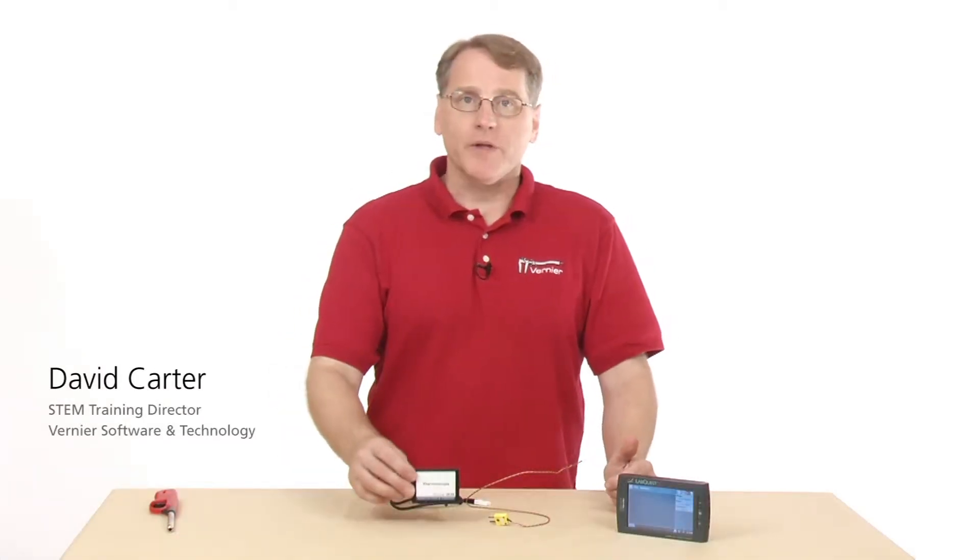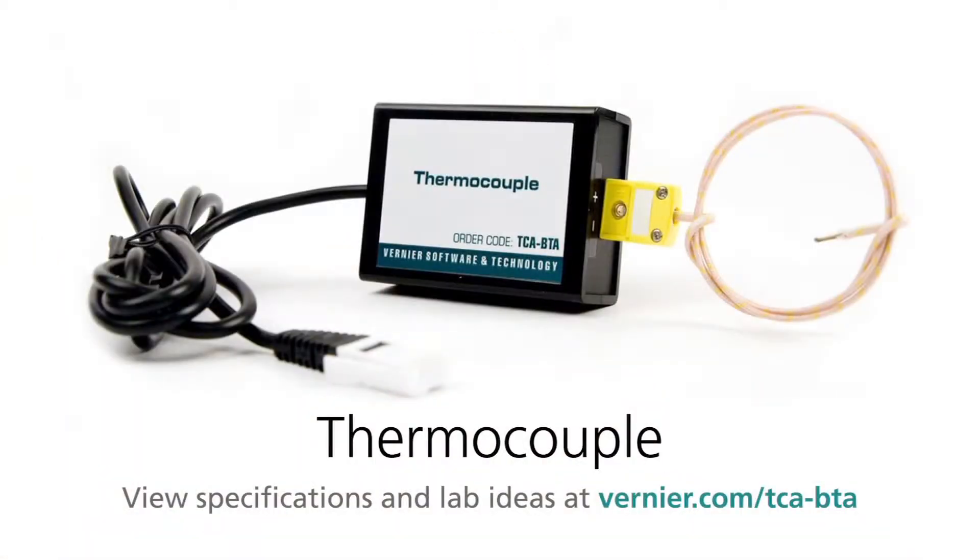This is the Vernier Thermocouple. It's used to measure really wide ranges of temperature change. The real advantage of this is if you want to be able to measure something as high as a flame temperature, you can actually do this.